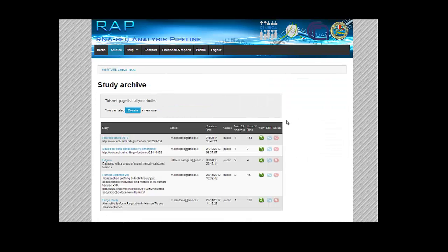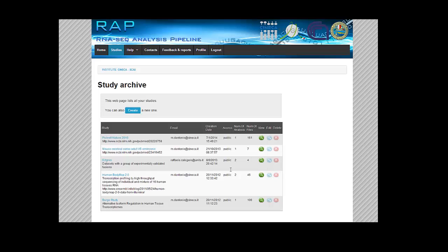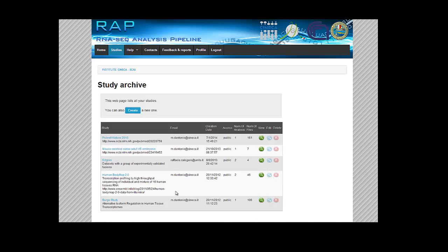All the studies are listed. Studies are like a project where you have all the information about your samples and analysis. Here you can see some public projects where freely accessible data has been downloaded and analyzed to compare the final results with the ones in scientific press.